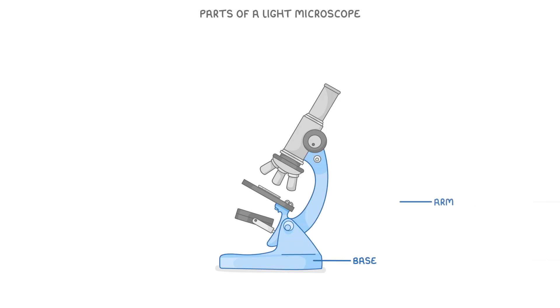Next, let's move on to look at the different parts of a light microscope. Supporting the whole thing is the base at the bottom, and then the arm that connects the bottom to the top.